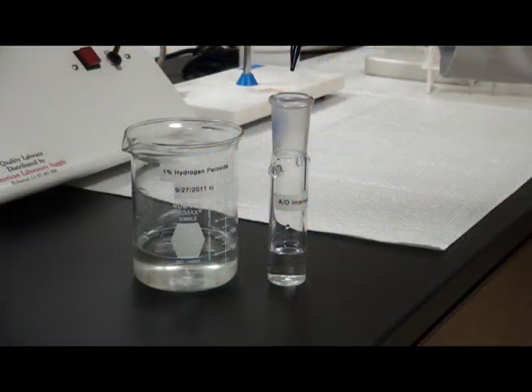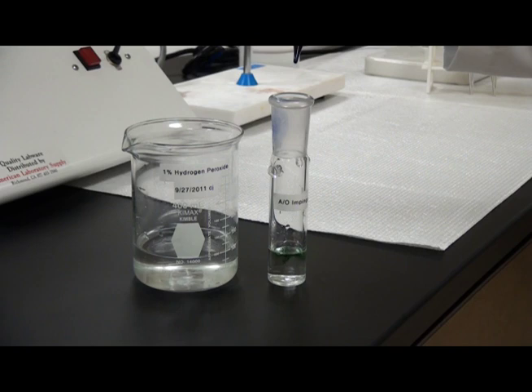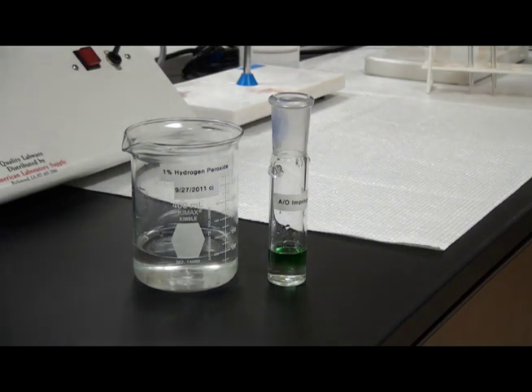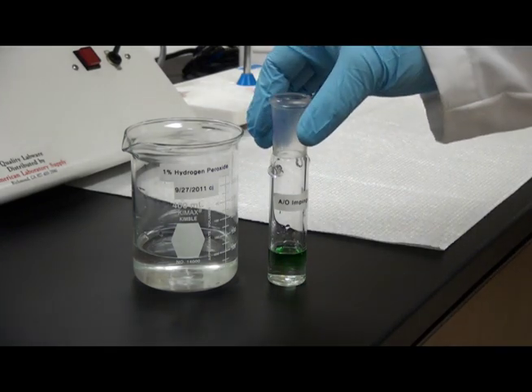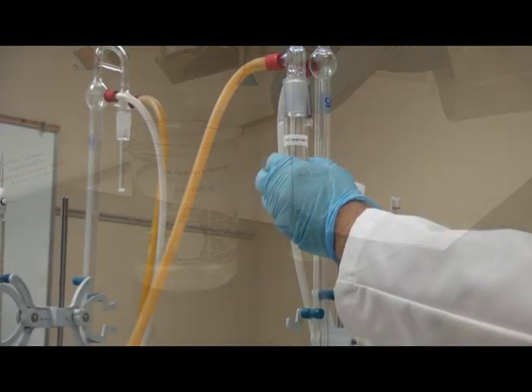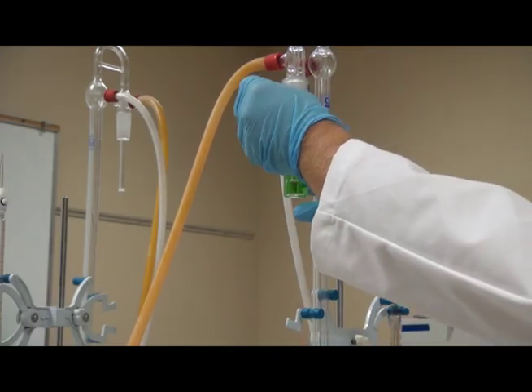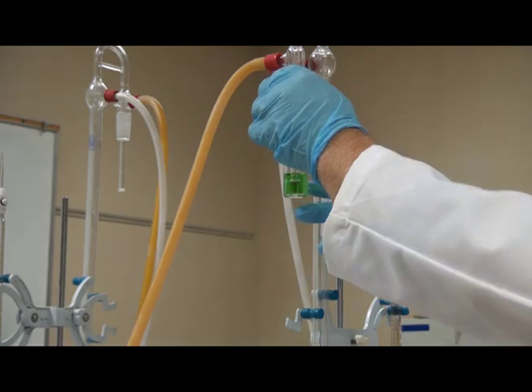Prepare a second impinger tube filled to the 10 ml mark with a 1% hydrogen peroxide solution. Add three drops of SO2 indicator. The liquid should change to the gray-green color. Secure the impinger tube onto the apparatus with the impinger tube fully seated in the spring holders attached to the glass ears.